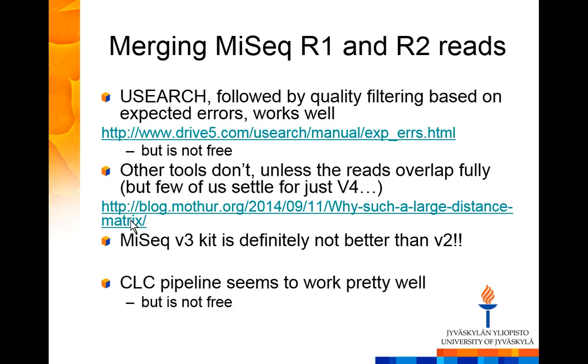I think there your template can be as long as you want, but you will only sequence as long as your chemistry allows. There doesn't need to be any overlap. I'm under the impression that in MiSeq you could have 600 base pair long templates, but merging would then be the problematic issue. But yeah, using just read one is perfectly fine. Again, there are lots of publications with that done.